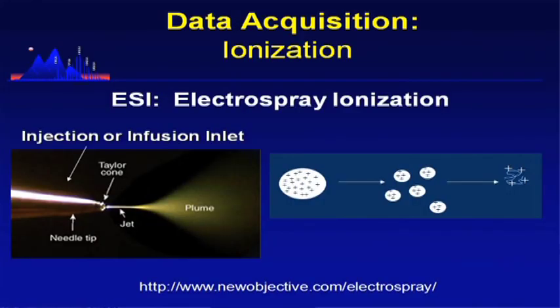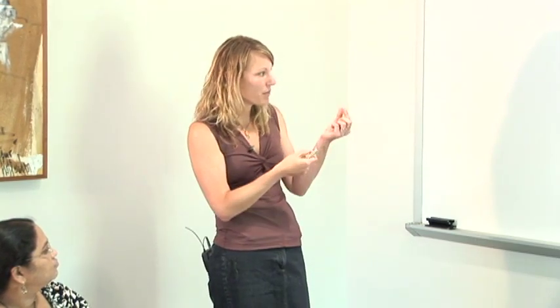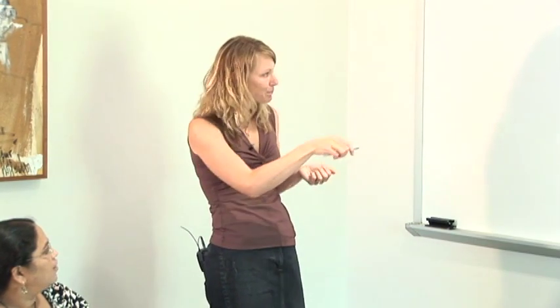Okay, so electrospray ionization is our other type of soft ionization. And in this case, again, we're doing liquid phase. So most likely we've got an HPLC out here, and then our liquid that contains our peptides is flowing through this little tip. And these are really small. Nicole will show you this. They have a little video where you can see the little tips. But they're really, really small. They're like hairs. And it's pulled fused silica, actually. And so the tip is very fine, generally about maybe 30 microns in diameter.